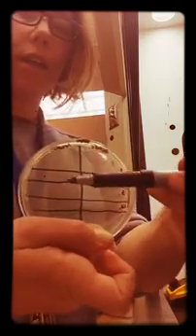1, 2, 3, 4, at least 4 cleaners. So actually, let's just do 4 lanes for each cleaner. And really, I guess you don't have to test each finger. You can do all these tests with, say, the index finger if you want. But anyway, labeling 4 lanes, right? 1 for each cleaner. And so I just put the number and then drew a line.